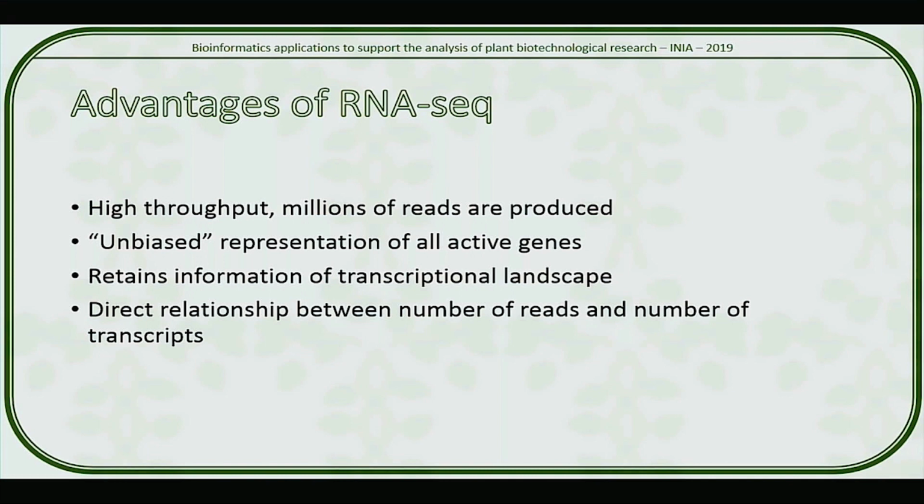Except for one. But Illumina RNA-seq by itself is not going to produce reads long enough to sequence a full-length transcript. You will sequence snippets of it. What's more, for each transcript, you will have a different number of transcripts in your original RNA extraction.